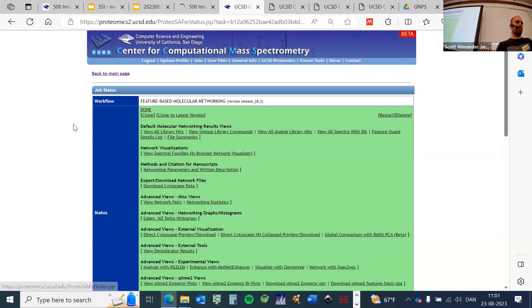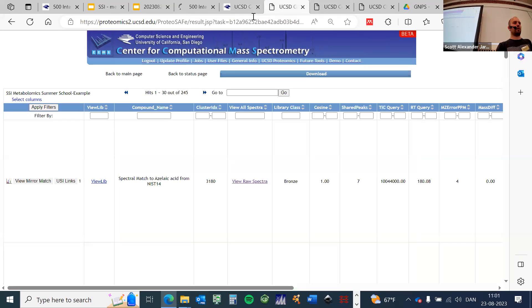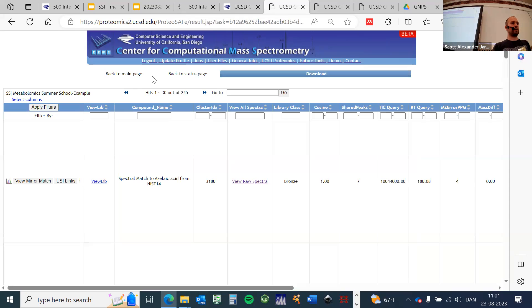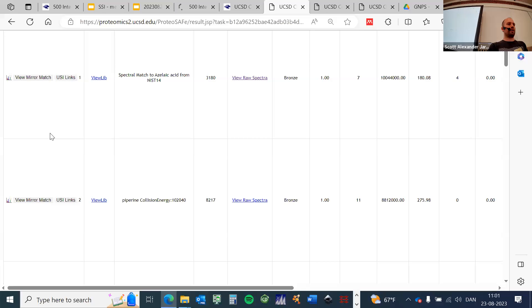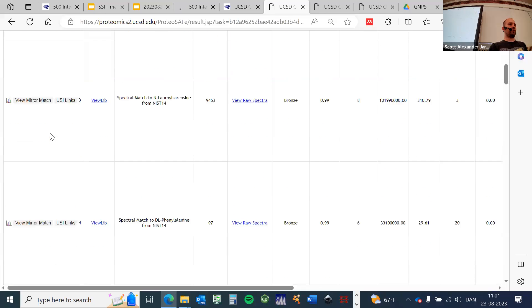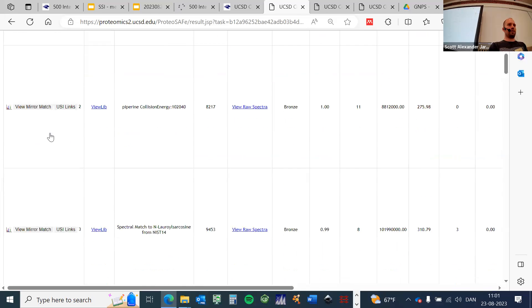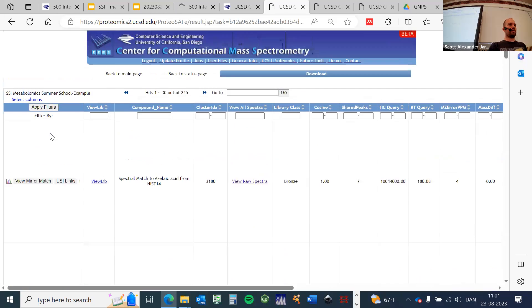That's why I typically go first here on 'View All Library Hits.' When you click on this, a new window should pop up where you get a long list with different molecules that were annotated.